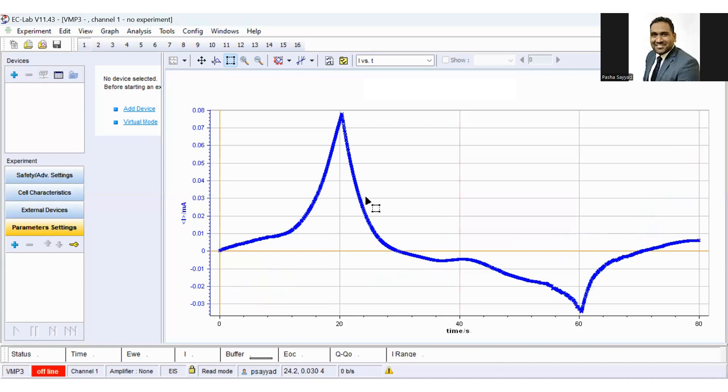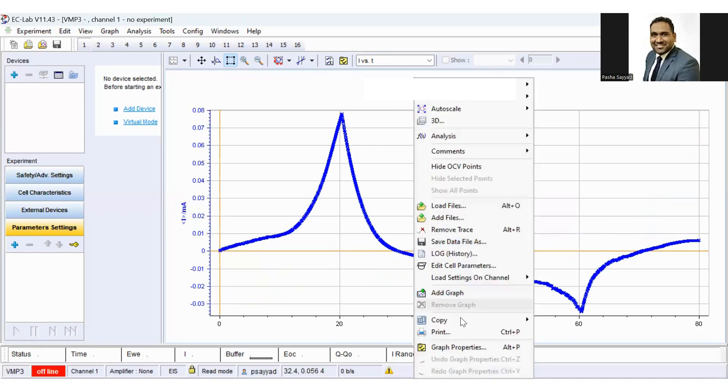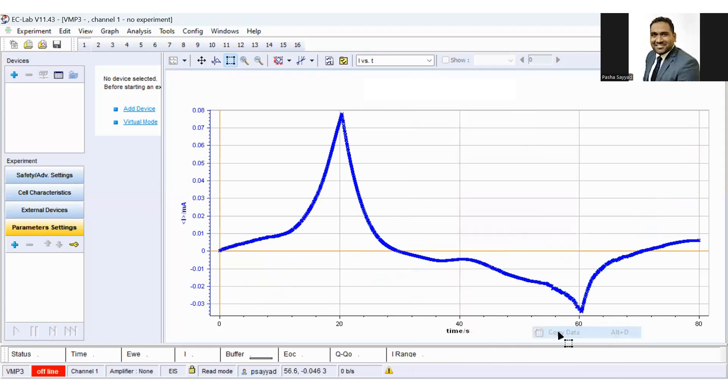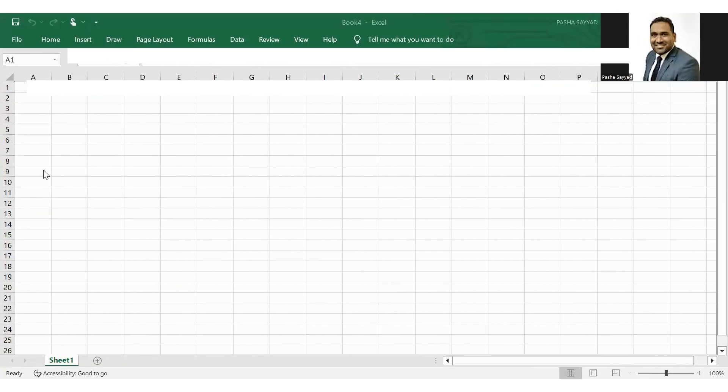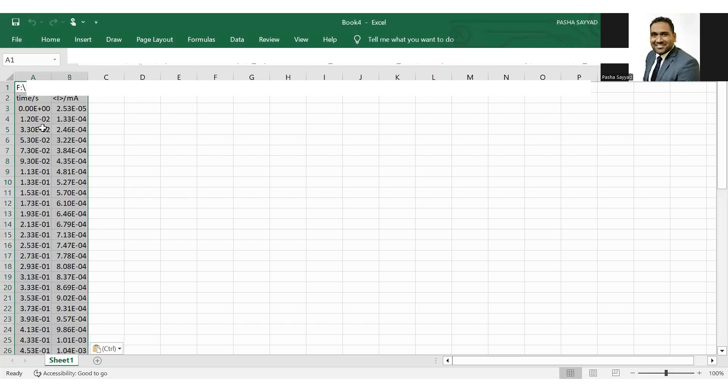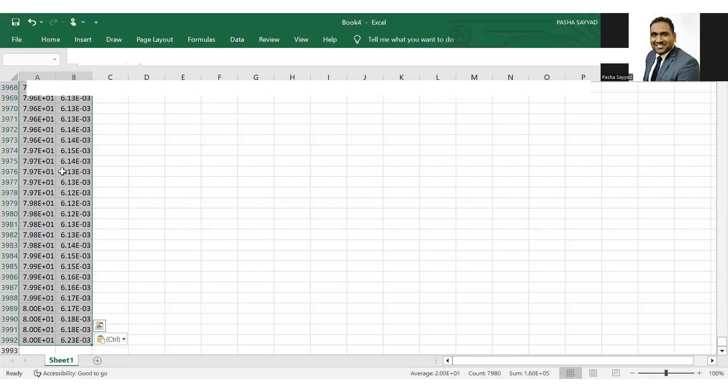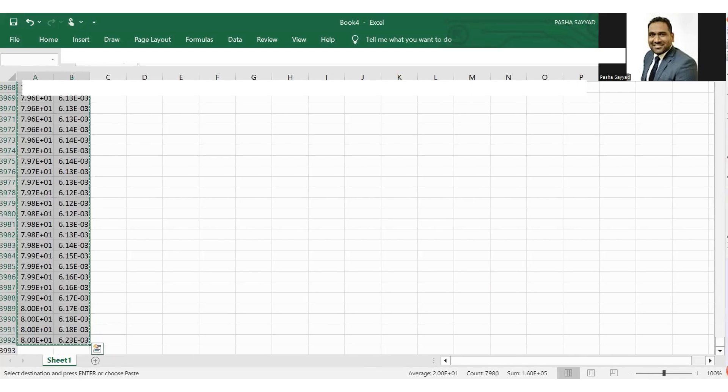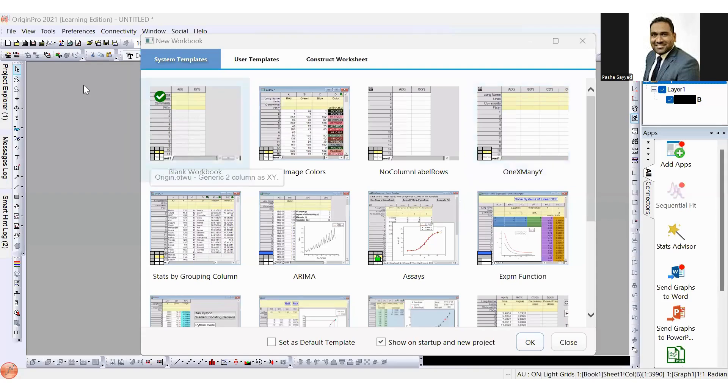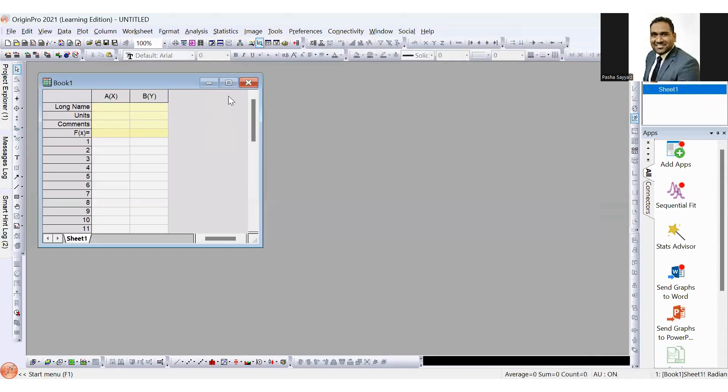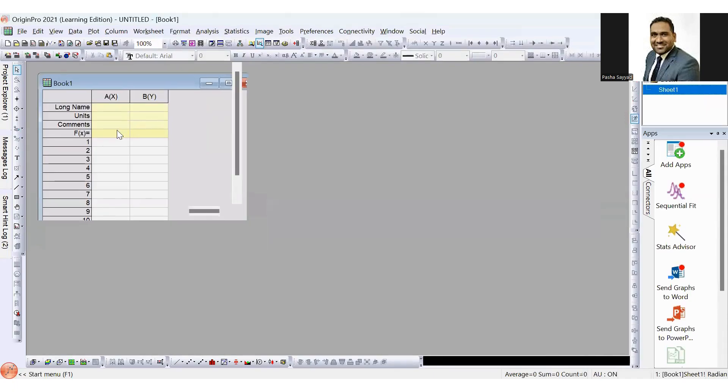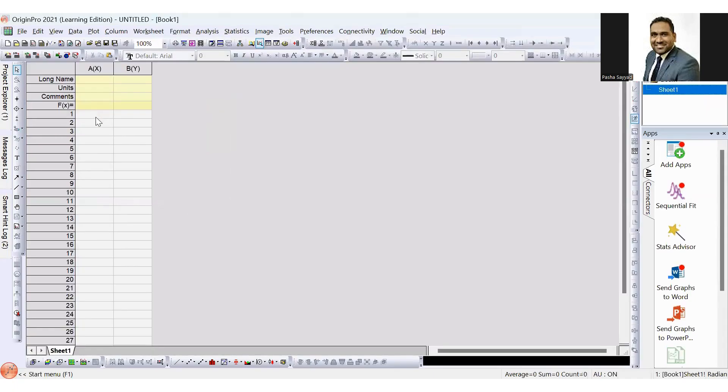To save this data, right click and copy data. You can paste this data into an Excel sheet, copy this data, and paste it in Origin.